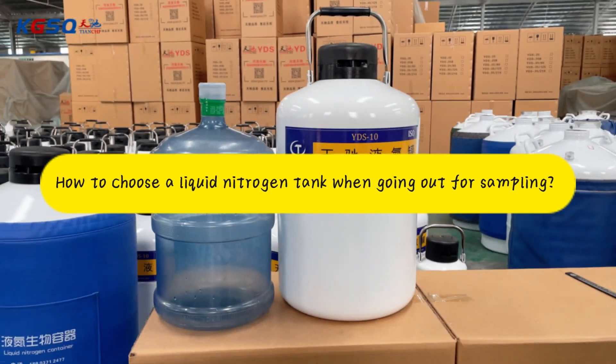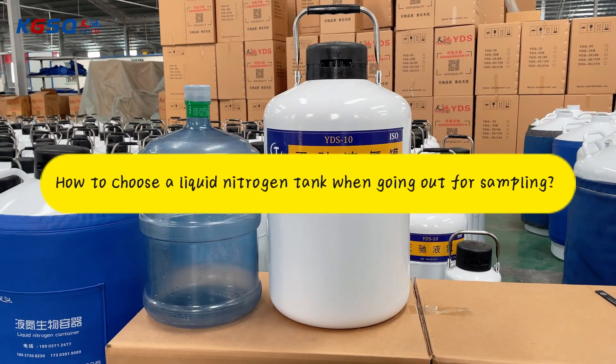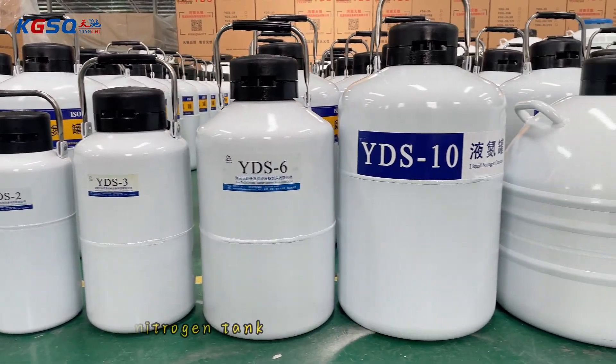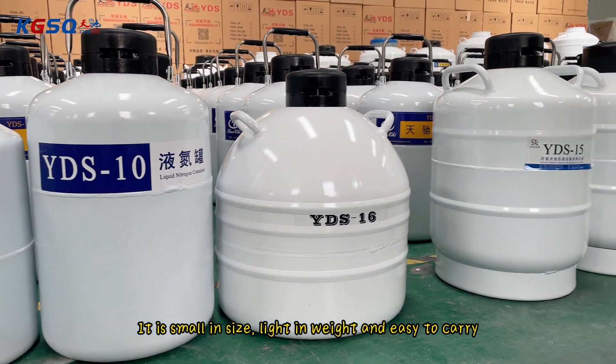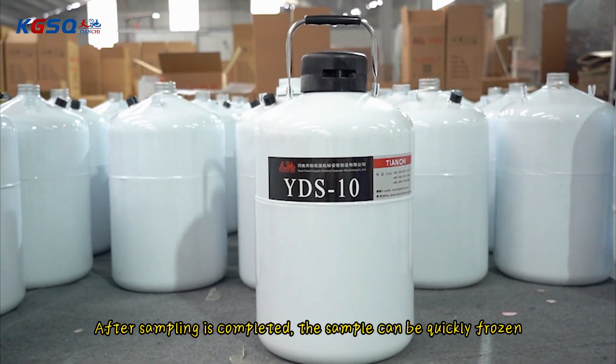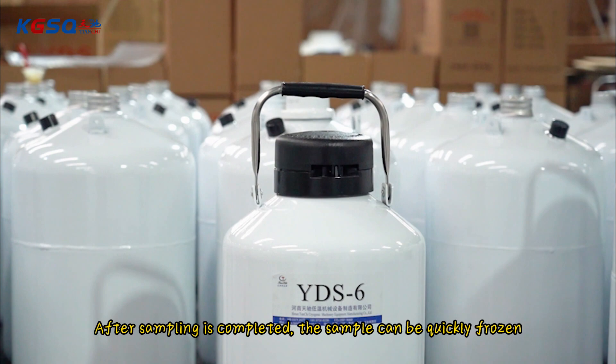How to choose a liquid nitrogen tank when going out for sampling? Recommended 10L portable liquid nitrogen tank. It is small in size, light in weight and easy to carry. After sampling is completed, the sample can be quickly frozen.